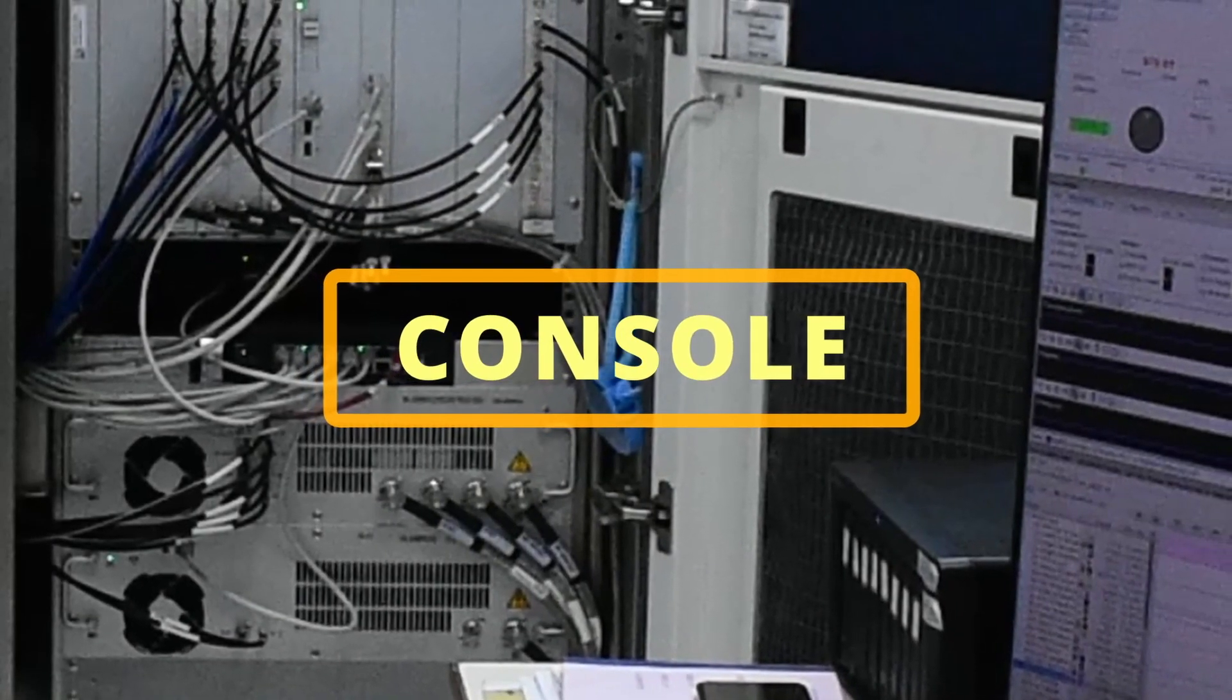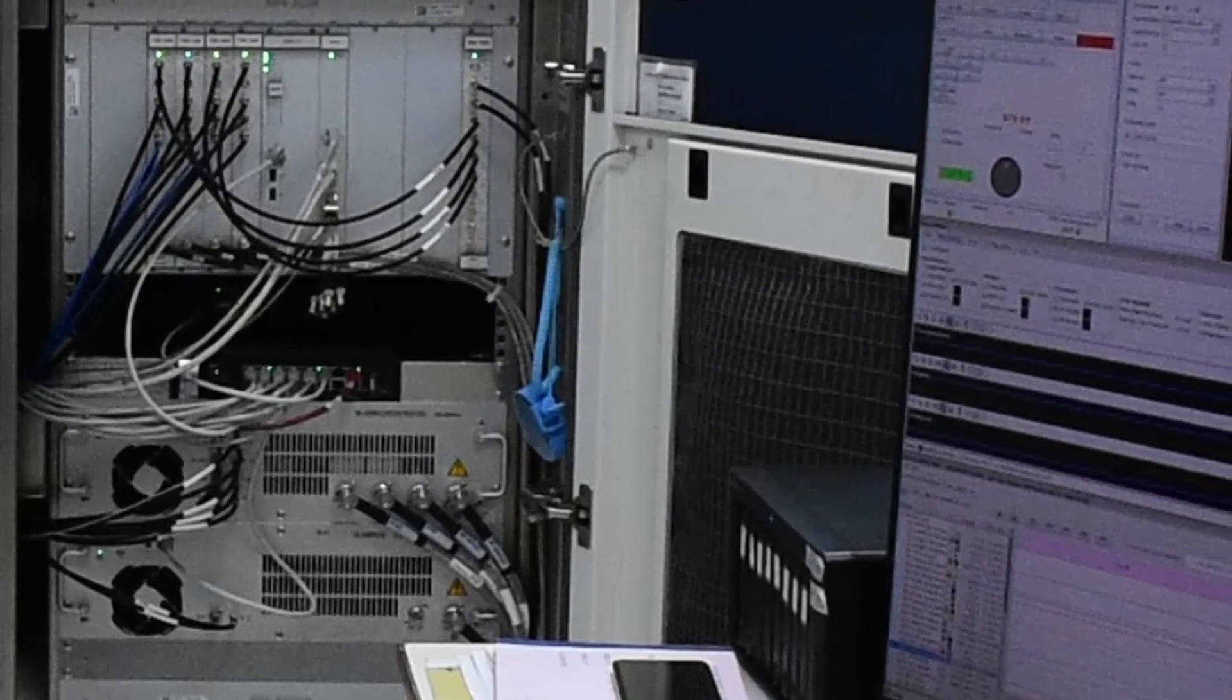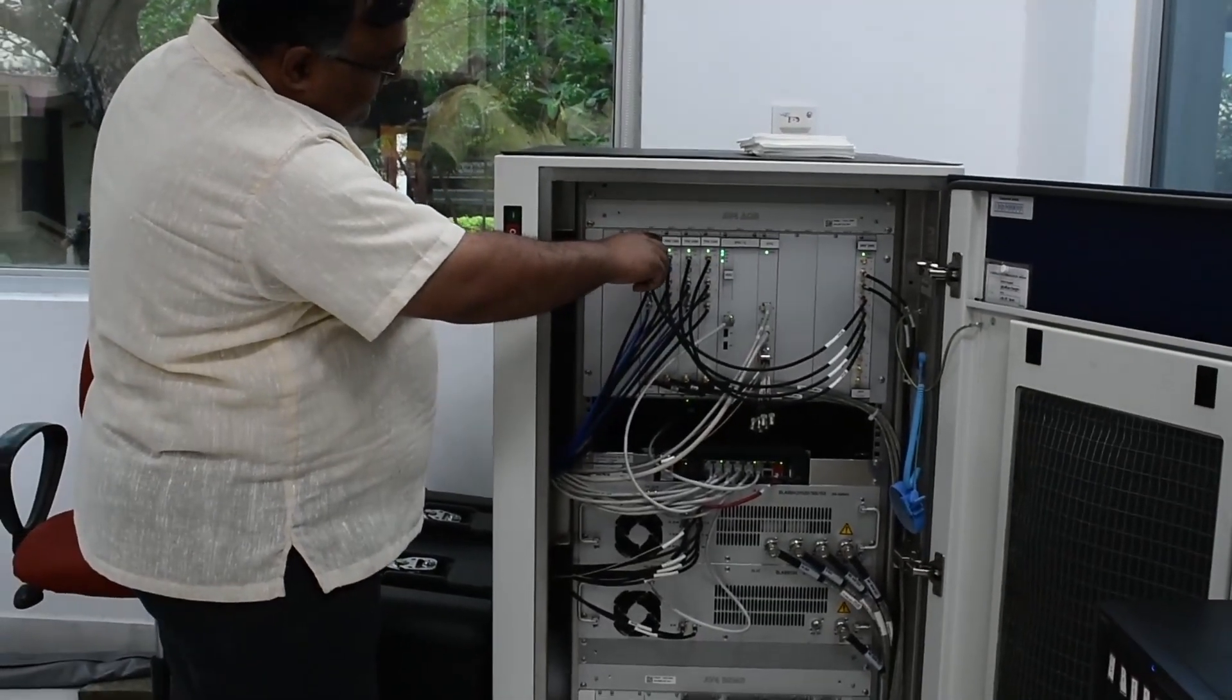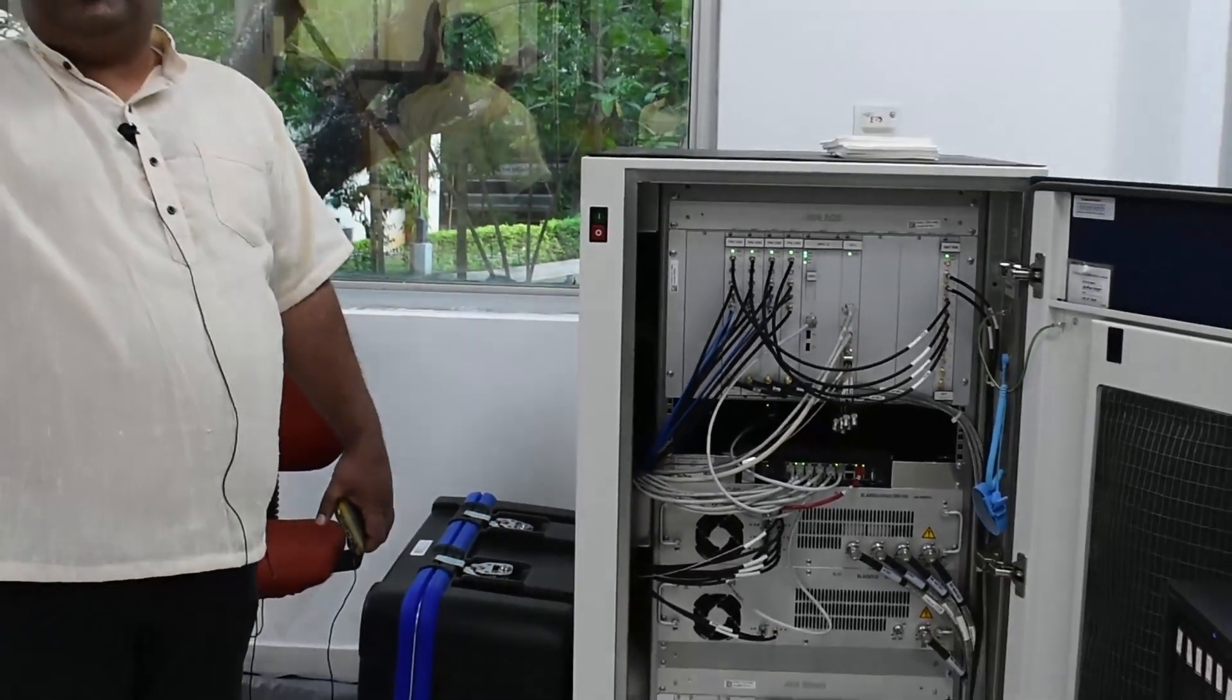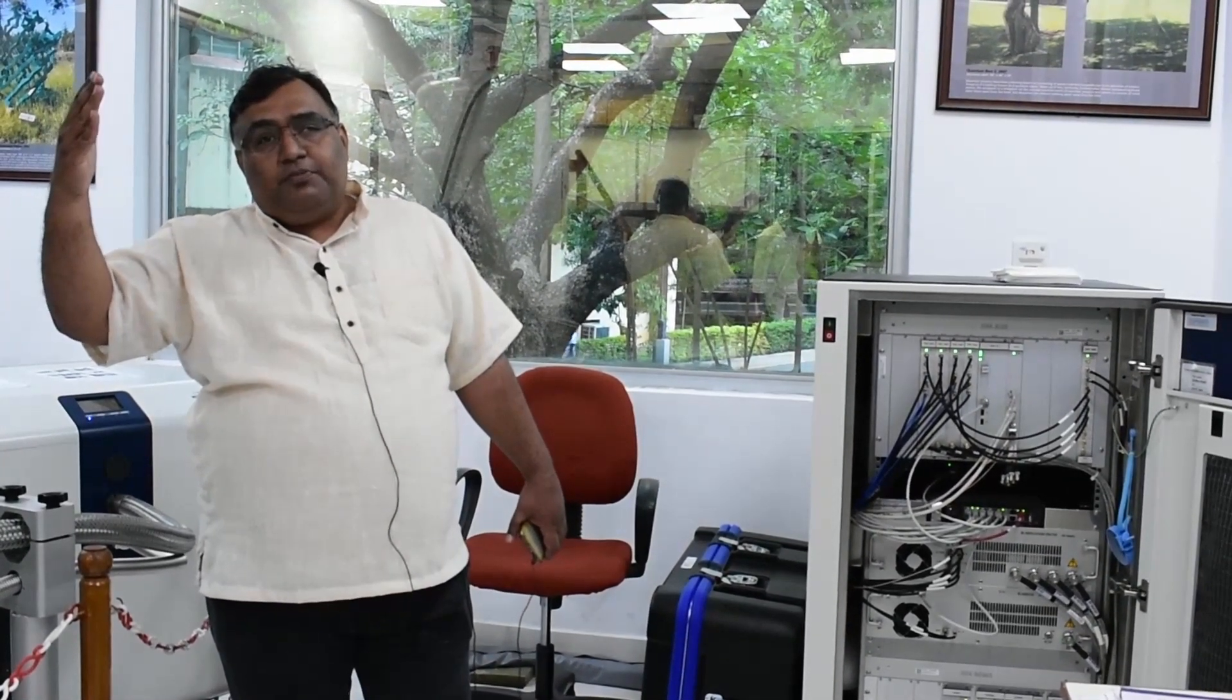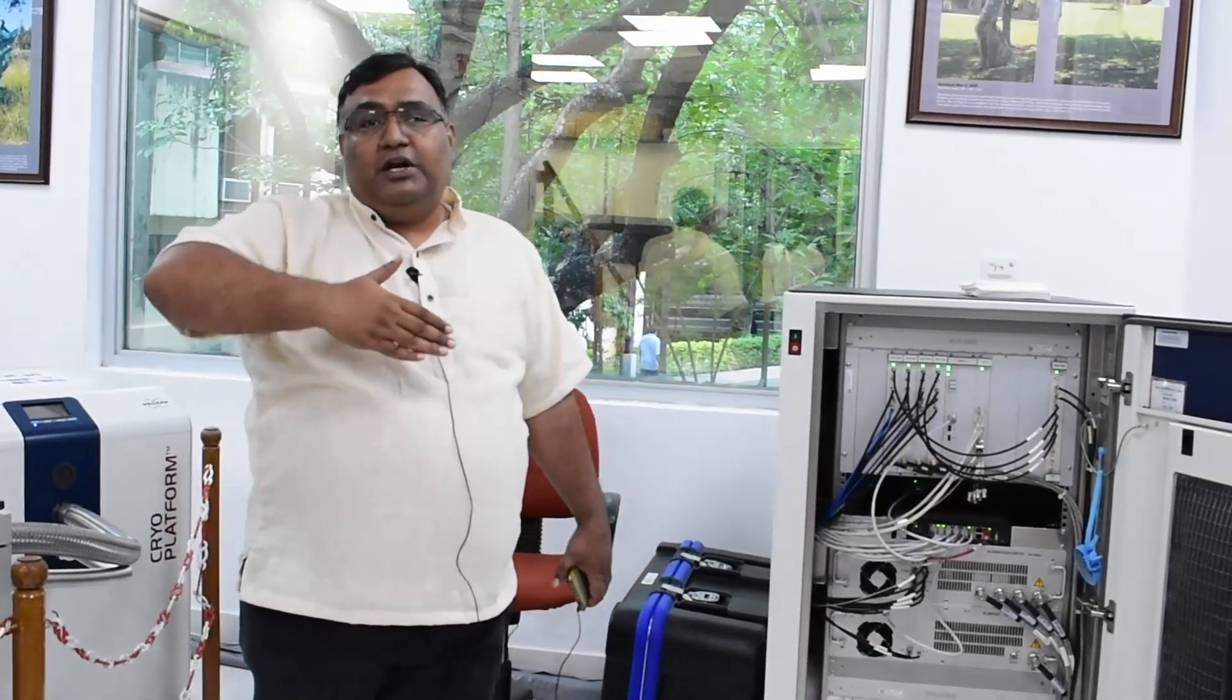So this is like a big radio station. Because radio frequencies are generated from here. So these are the four TRXs. They generate the frequencies from the TRX. You get a signal to the amplifier. Amplifier amplifies it to the value because when you have to tilt the magnetization from plus Z to the XY plane, you need a frequency and you need power.